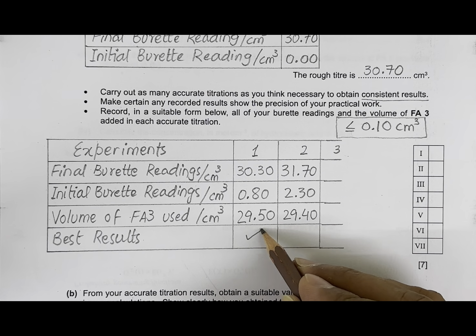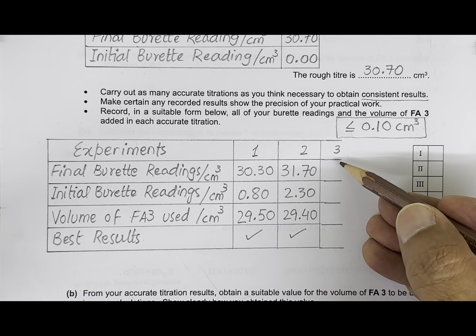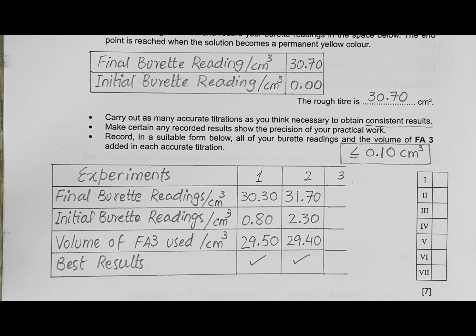Now I will tick these two results to show that they are good enough. If not, then I would have performed it for the third time, and then I would tick which two values here are 0.1 maximum apart from each other. Now let me tell you about these 7 marks here in this part A. Where are those 7 marks?